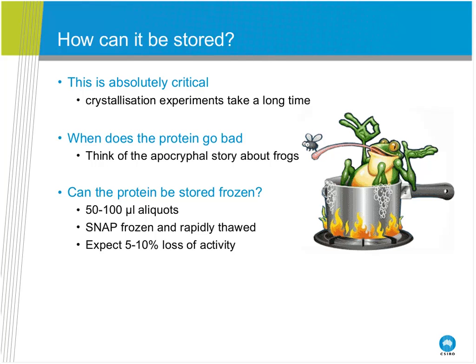And so if you have your protein, which is sitting in an ice bucket in the cold room, and you religiously change the ice so it doesn't just float, that's great. When is that protein likely to be bad? You can sort of say, you know that in 10 years' time it will be bad, but is it bad in a week's time? Is it bad in 2 months' time? Is it bad in 10 years' time? If you can work out how to store your protein frozen, that gets rid of that whole frog, when is it bad issue.